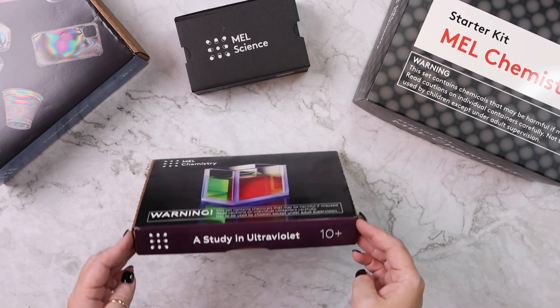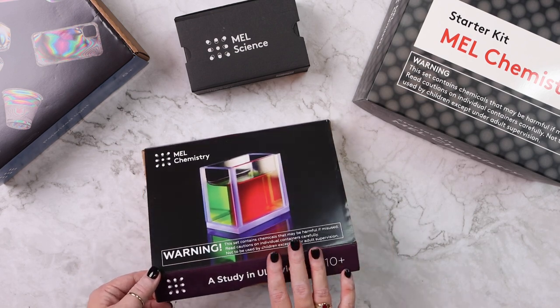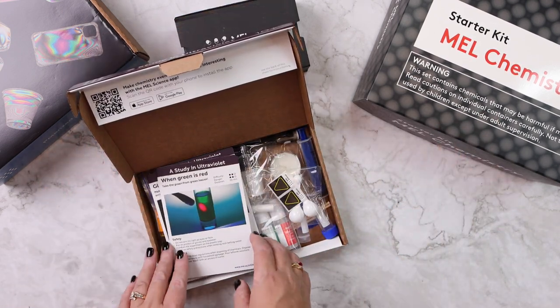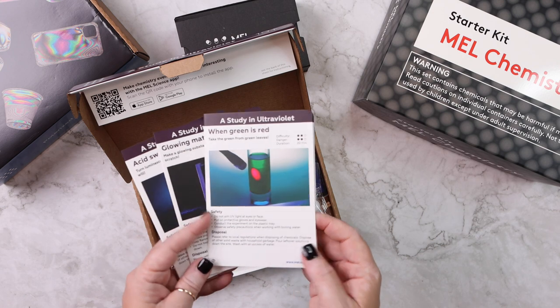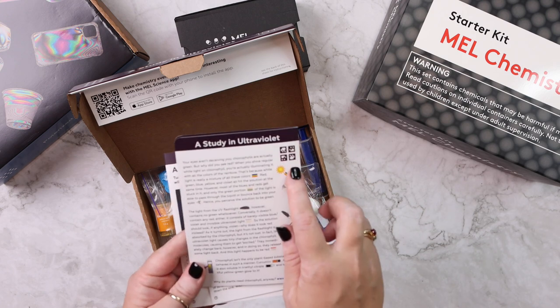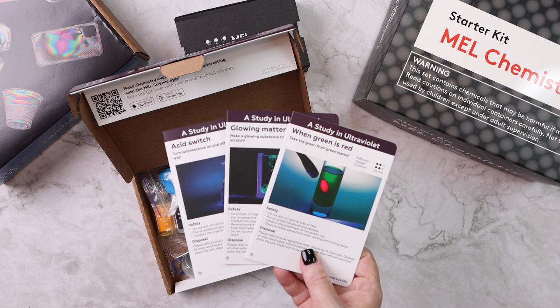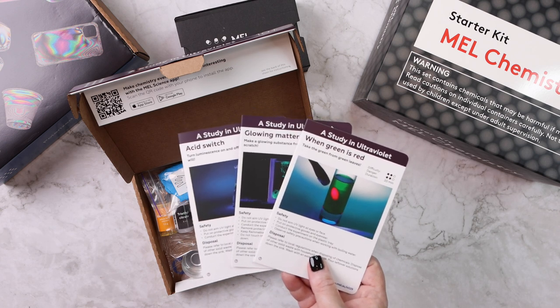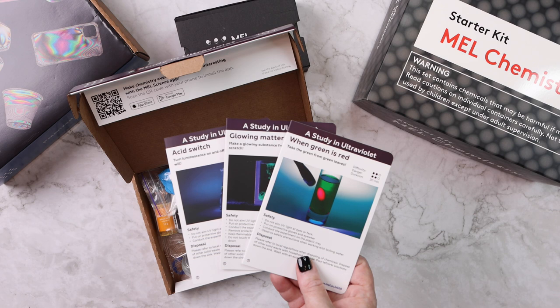Subsequent months you receive a smaller box like this. This one is a study in ultraviolet and it includes everything as far as the chemicals and the instructions. Anything reusable was already delivered in the starter kit. This one comes with three experiments — 'When Green is Red' is one of them. What's really cool is you can scan the QR code and they walk you through by video. The video walks you through, explains the science, tells you the steps, and if you have to wait 10 minutes, there's a 10-minute timer built into the app.